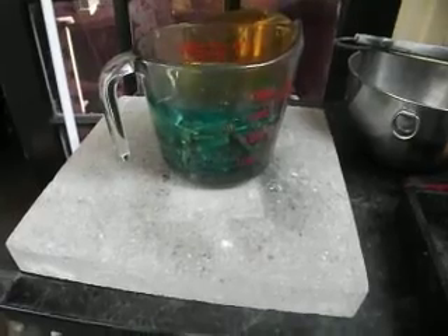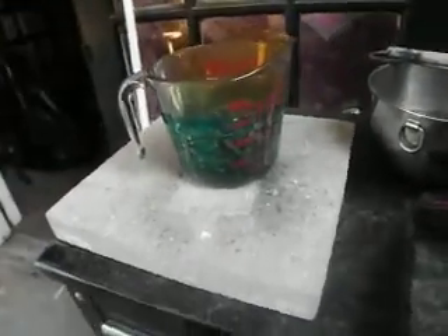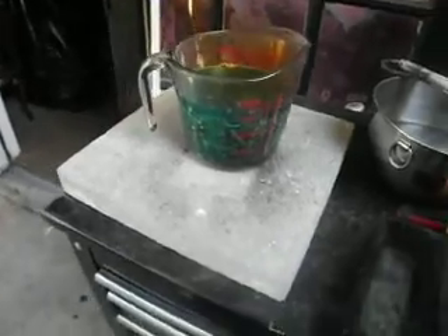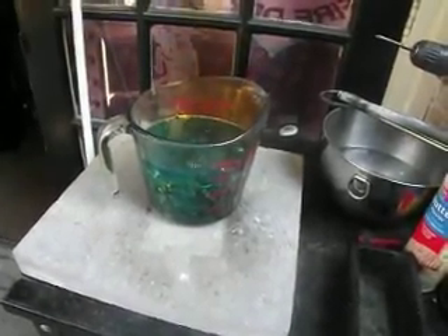I'll do another video of testing it to see if all the nitric is out before I filter it. I put in 300 milliliters of nitric and 300 milliliters of distilled water. It's sitting in like that.